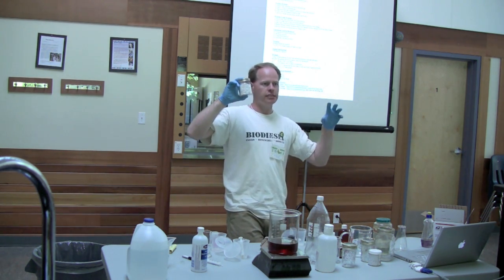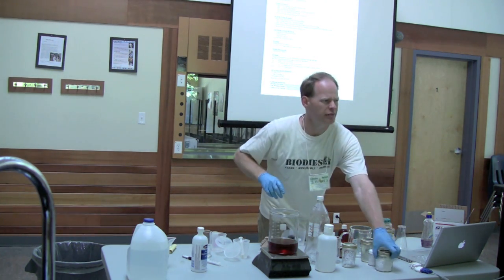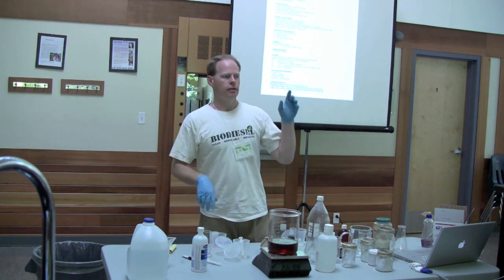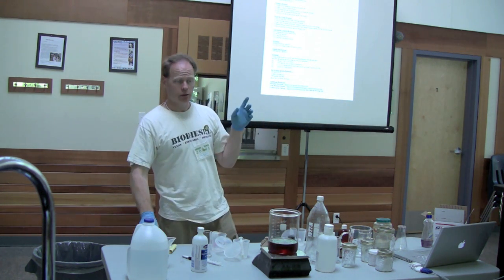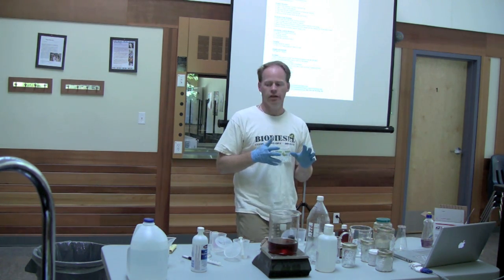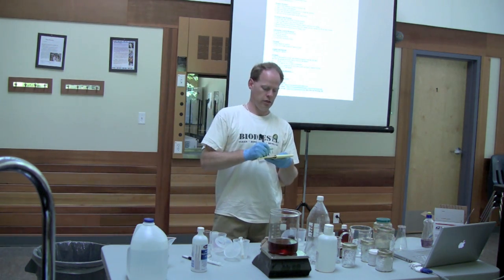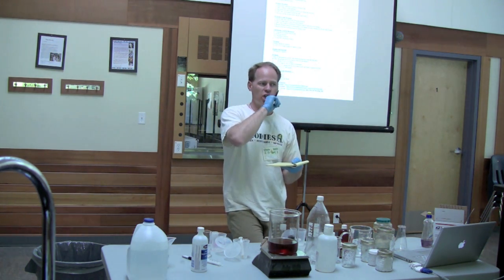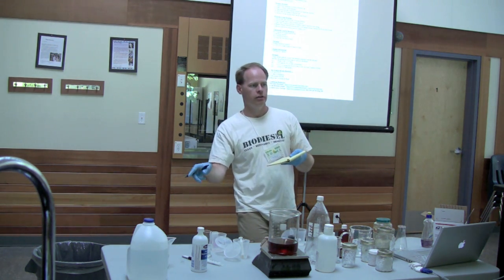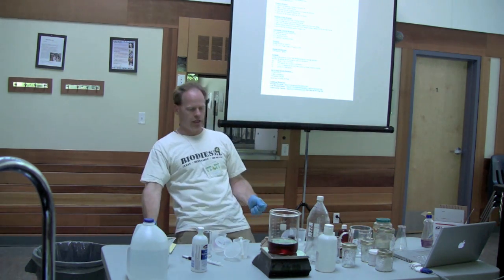When we refer to base amount, it's how much of this stuff it would take to make biodiesel out of the oil. So 7.8 grams if my oil titrated at 0. Then I add to it the titration value. We said it was 3, so 10.8, about 10.5. I'm going to kind of over-catalyze this batch today and go with 11. So I'm going to add 7.7 grams for every liter of oil, plus the 3, which is 11 grams per liter. Looks like I only had 500 milliliters.